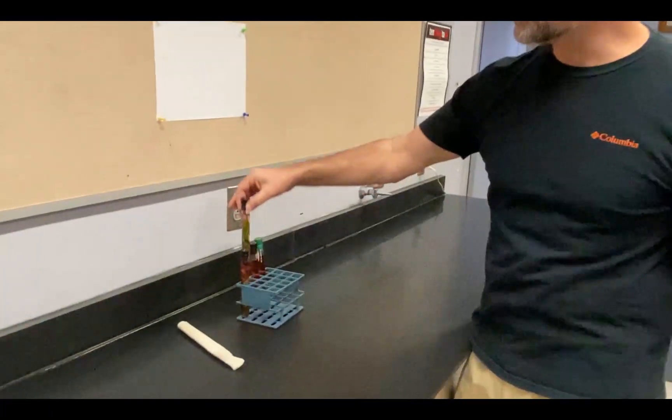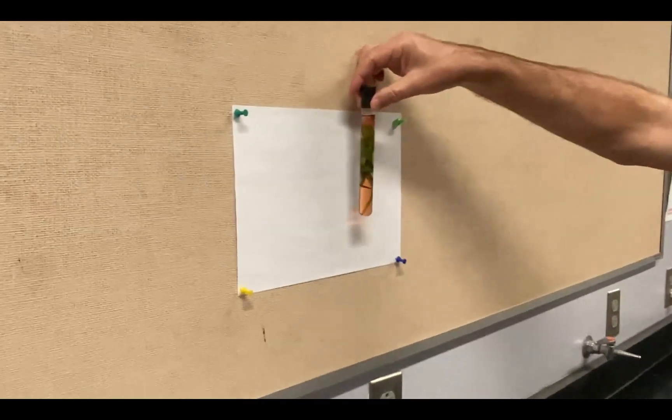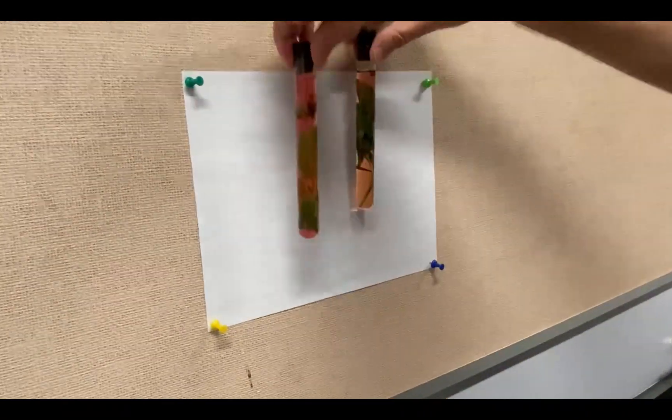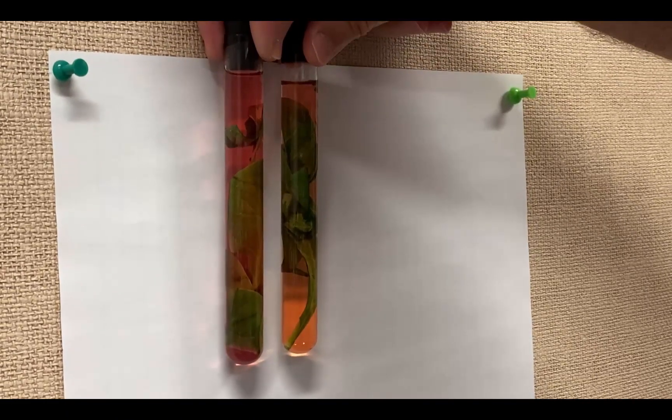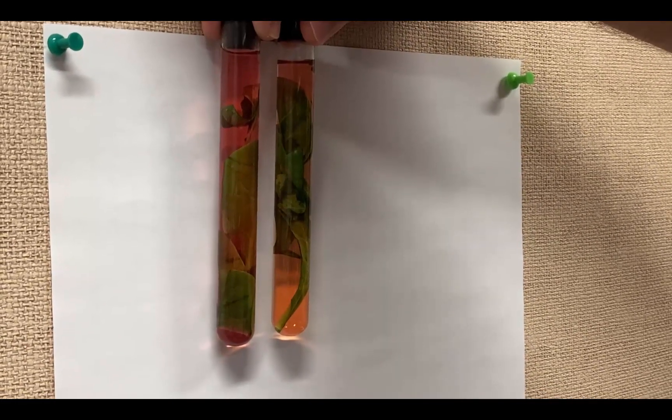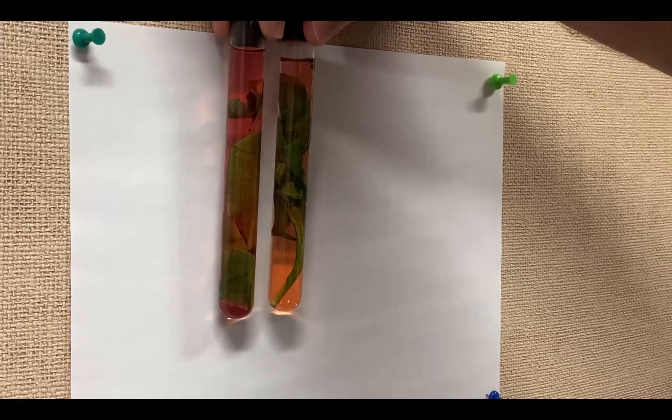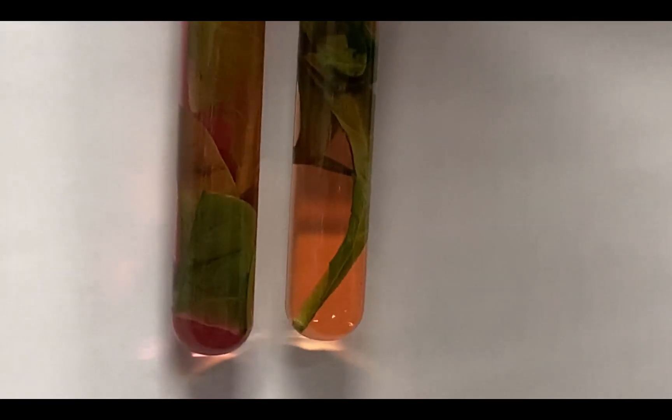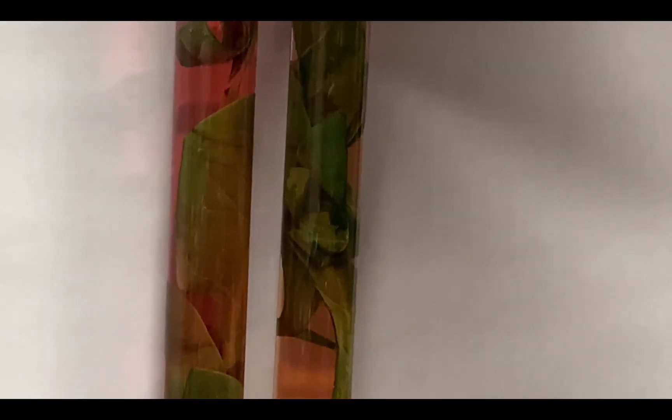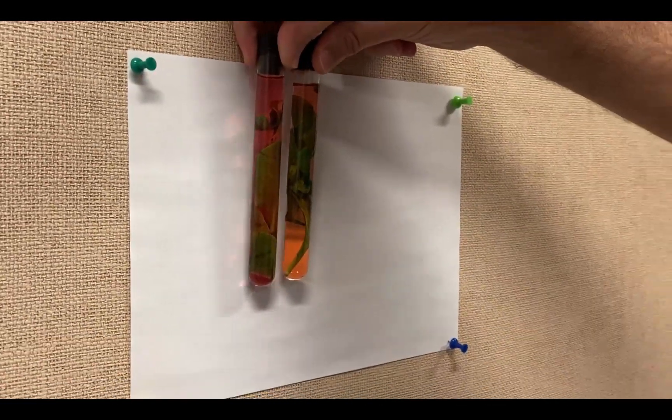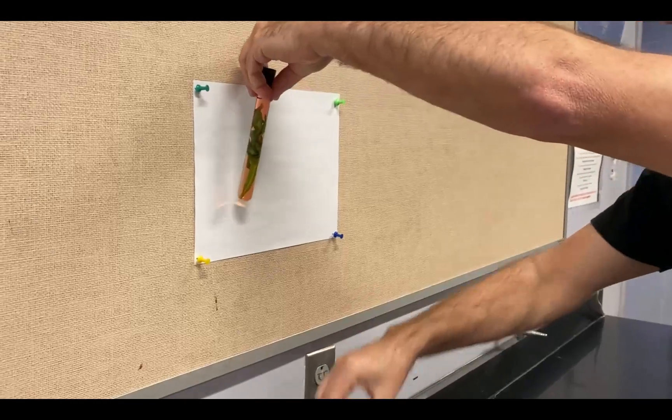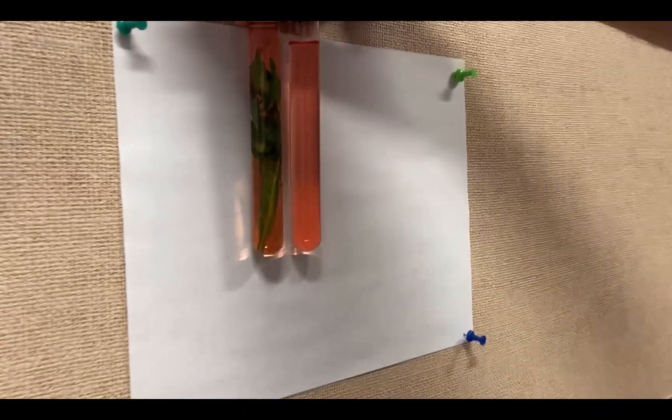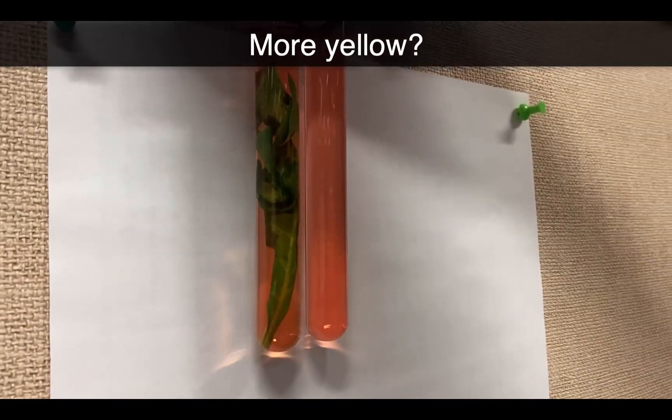Let's take a look at tube number two. I'll hold it up against tube number one. They started out the same color but are definitely not the same color now. We saw a color change in tube one, whereas tube number two actually got more yellow than it was initially.